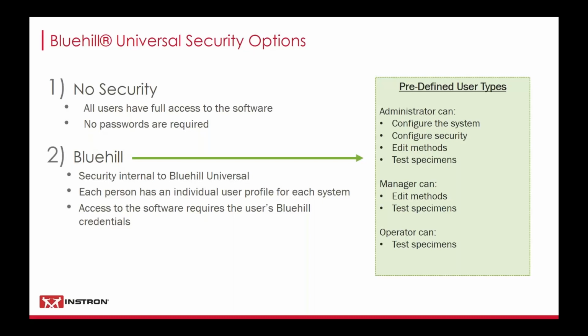So using Bluehill security, Instron has 3 predefined user types. So that's an operator, a manager, and an administrator.